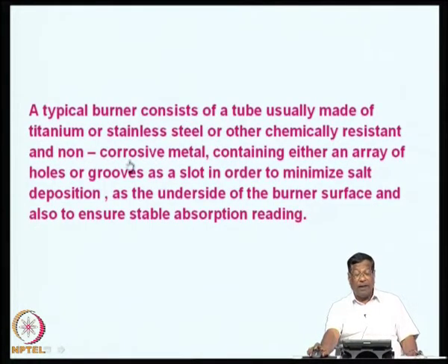A typical burner usually consists of a titanium base or a stainless steel base. There are other chemically resistant and non-corrosive metals that have been used, but mostly titanium as well as stainless steel burners seem to be of use.